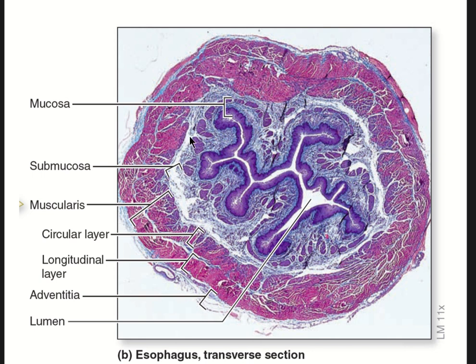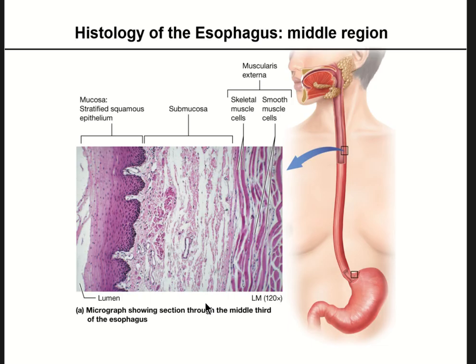And take a look at this submucosal layer. See how it stains a little bit wider and lighter, thanks to all those things we talked about before. And then I love this: this muscularis layer, this picture does a great job of showing you the different orientation of the muscle fibers. You've got an inner circular layer, and here you've got your outer longitudinal layer and your adventitia. So that's a beautiful dead giveaway for esophagus.